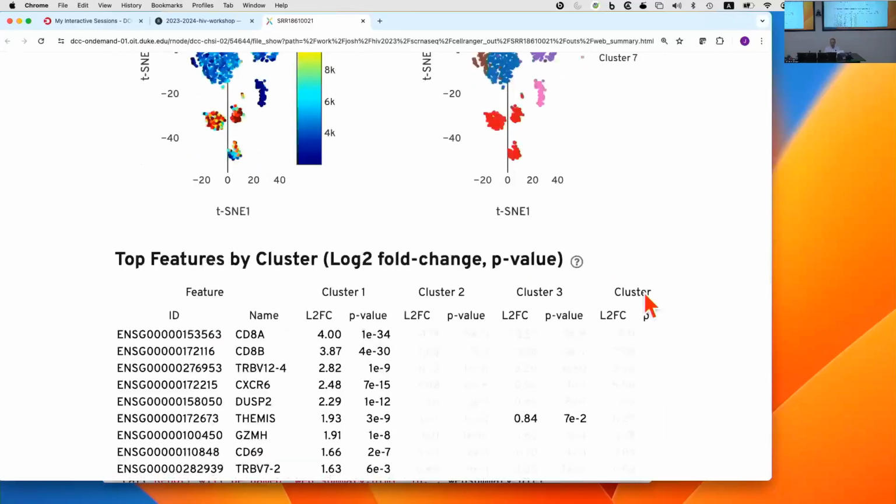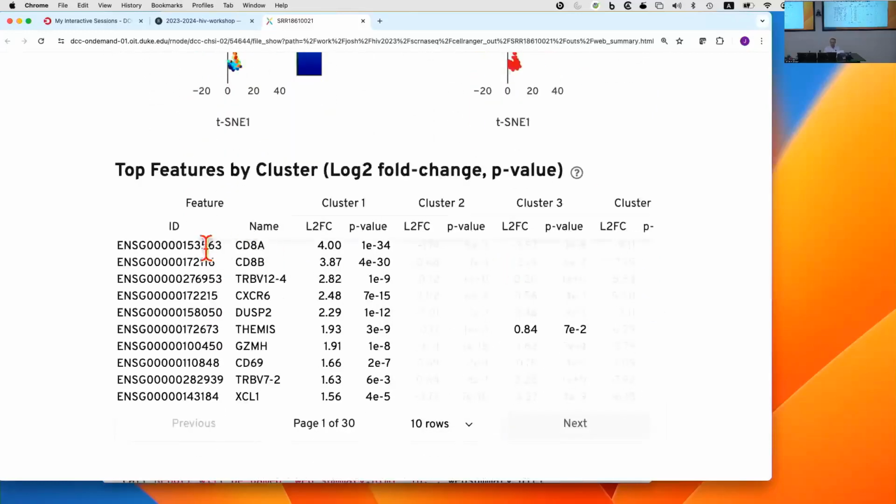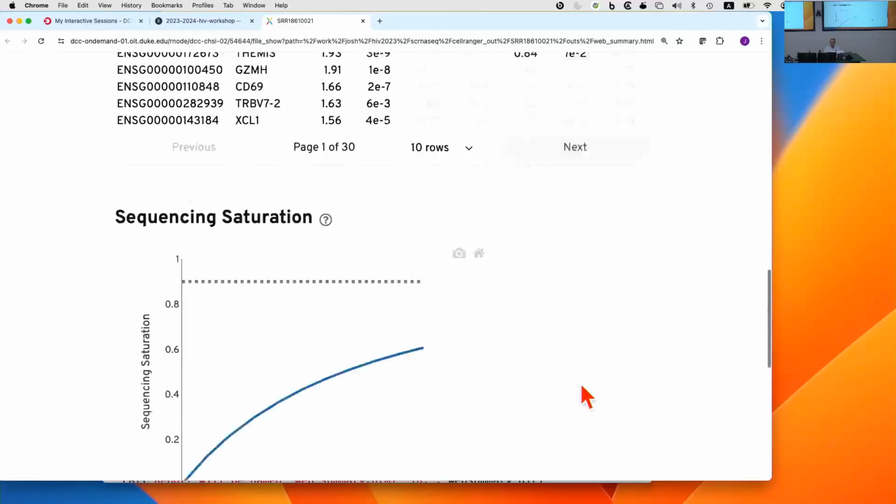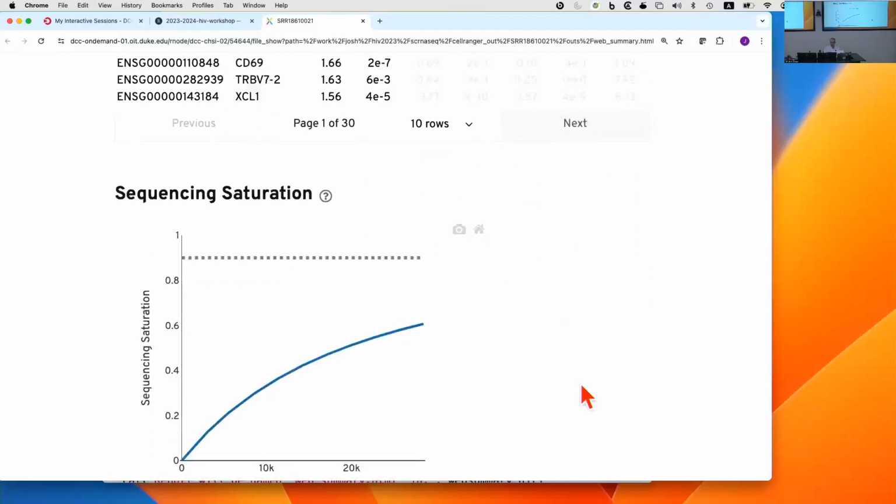You'll talk about that some next week. It tells you the top genes by differential expression across clusters. But of course, these clusters, I mean, there's nothing wrong with it. It's just not informed by the domain.